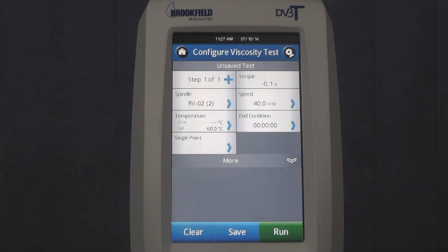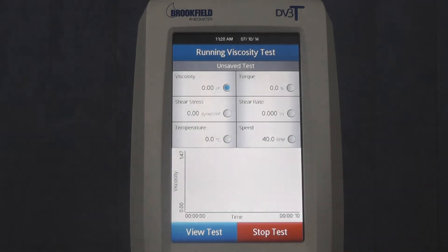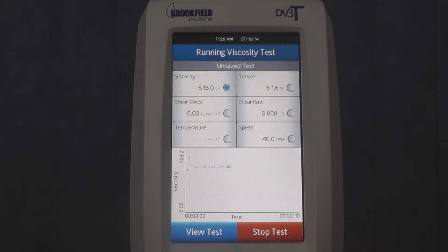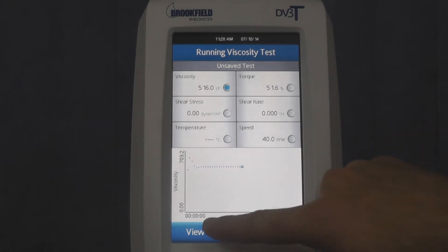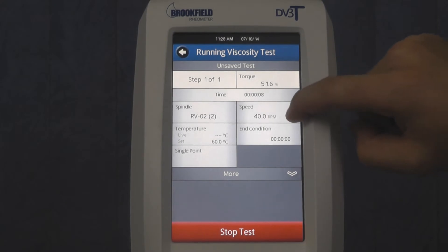You may have a need to change your spindle's rotational speed while performing a test. There are two ways in which this can be done. The first is the more basic of the two and can be done directly from the instrument during a test. All you have to do is press the view test button and then press the blue arrow in the speed field.